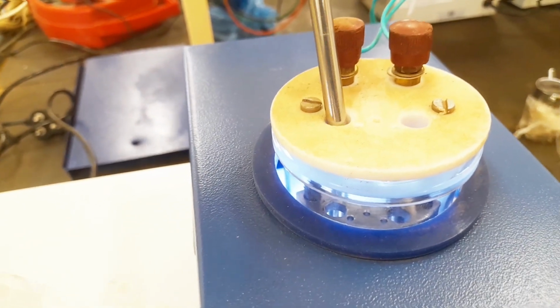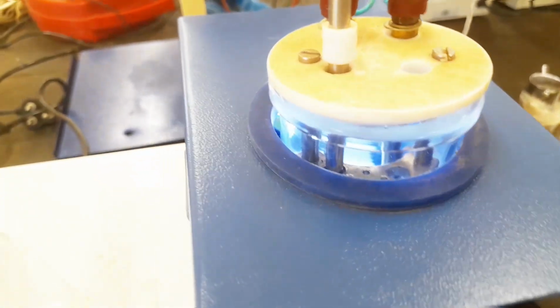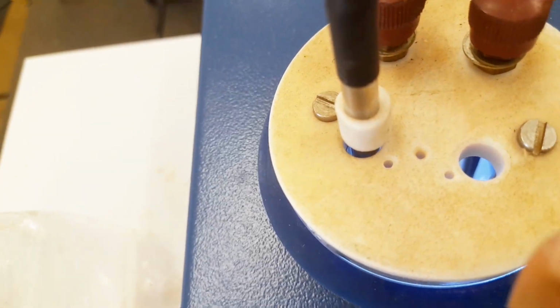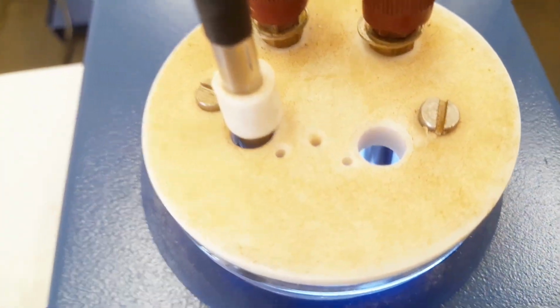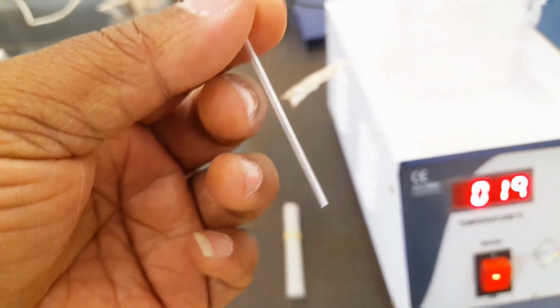This will show the circuit, this will show the temperature differences. Okay, so you can see small holes are there here, 3 holes are there. From these small holes we can keep the sample. Let us see, these are the capillary tubes. These are the capillary tubes which are closed on one side and open on the other side.